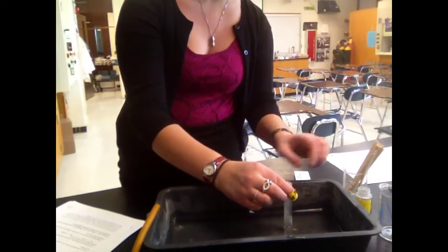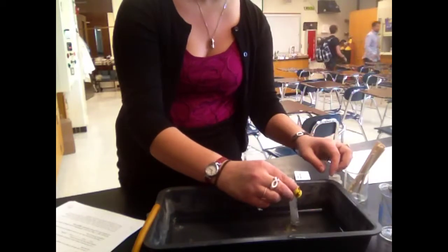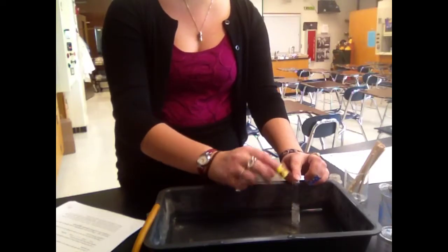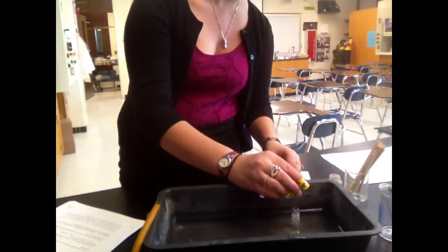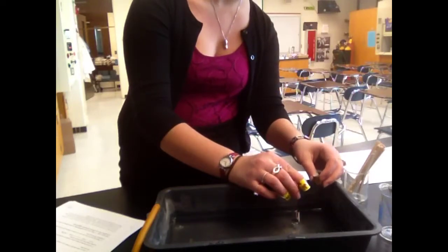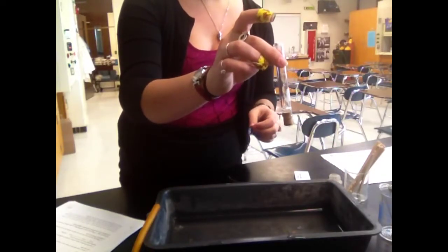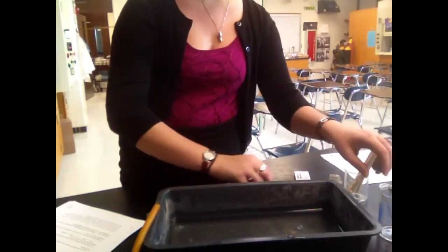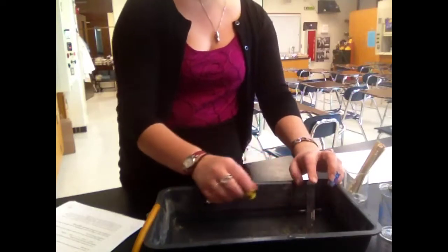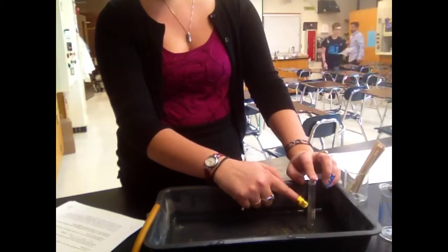Now I'm going to grab a little bit more calcium carbide. And it starts pushing the water out of the test tube. So we're going to fill up one test tube completely filled with gas. And once it's completely filled, I will plug it up. So this is our test tube completely filled with the acetylene gas. We're going to also fill up a test tube just halfway with gas. So I'm going to wait till it gets right about here, filled with gas.